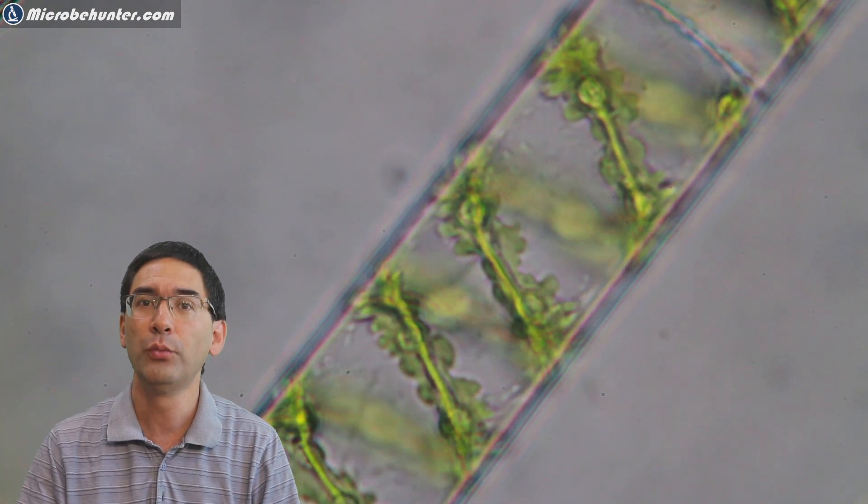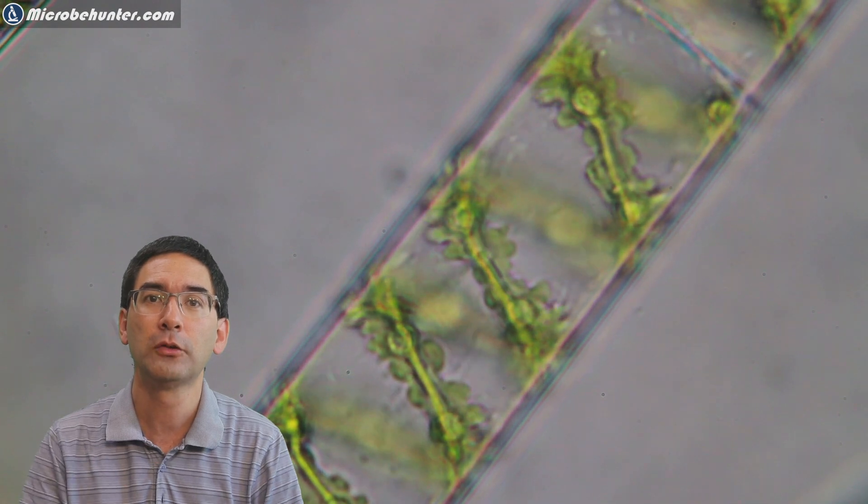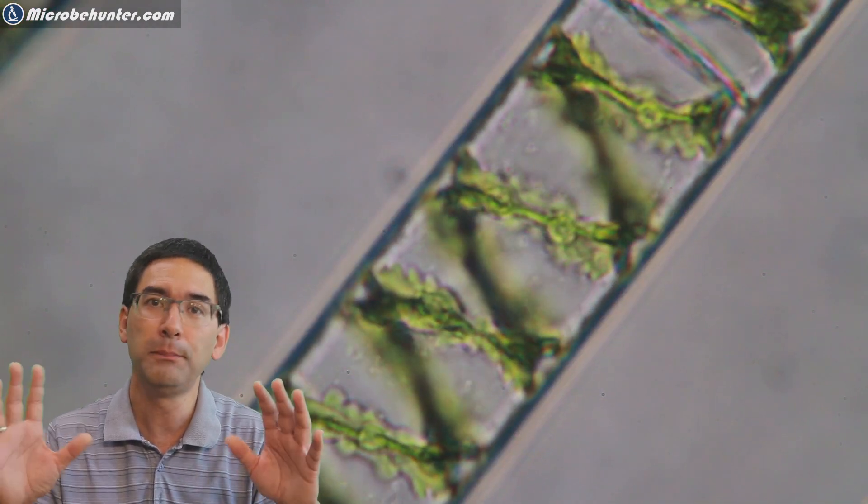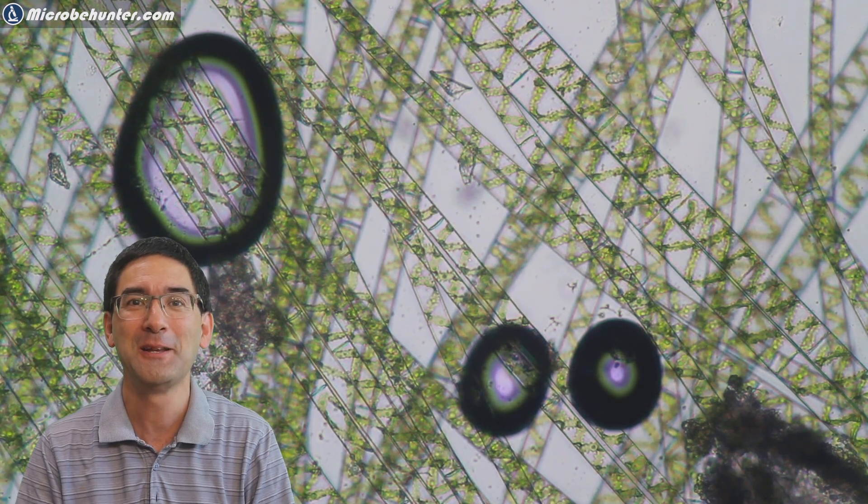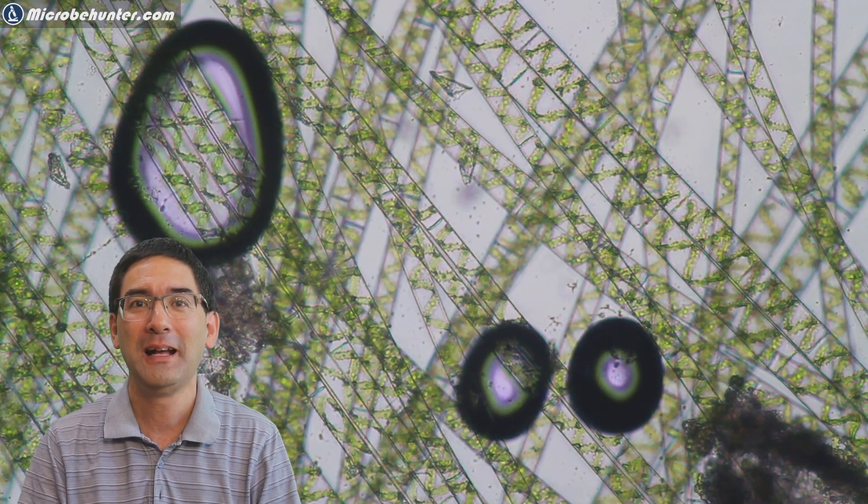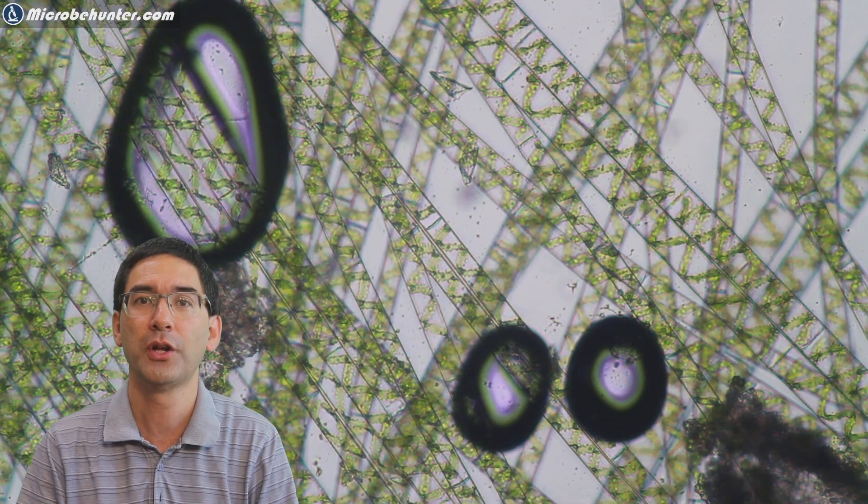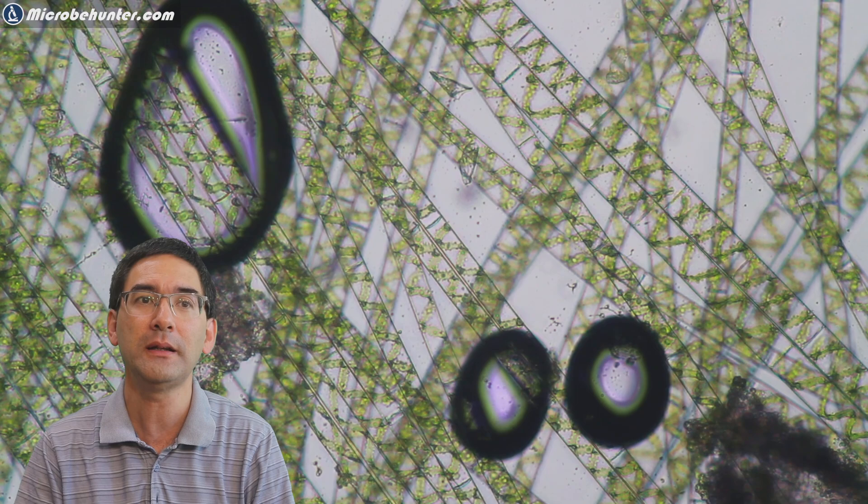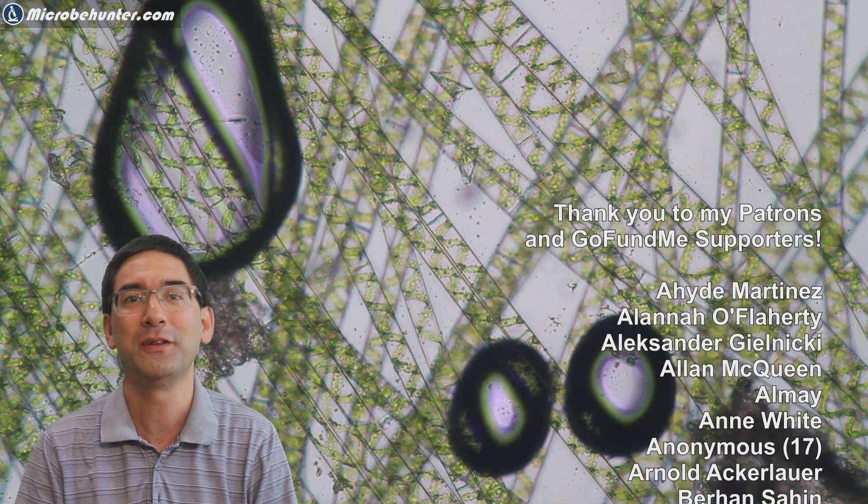Again when you have a higher magnification you can see the spiral shaped chloroplast much better. Yeah and there are plenty of oxygen bubbles so of course I had to repeat everything in again a different place. Here we've got three bubbles and again under time lapse I was able to actually watch those bubbles grow very quickly and it's kind of fun to observe and interesting to see.